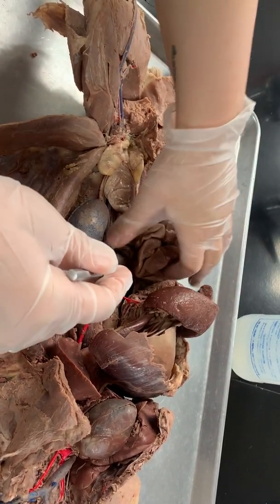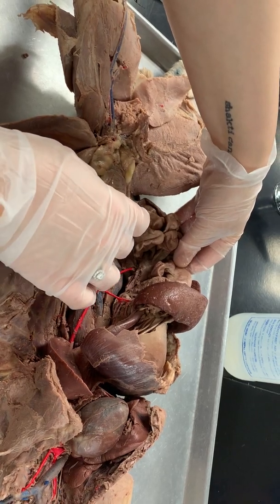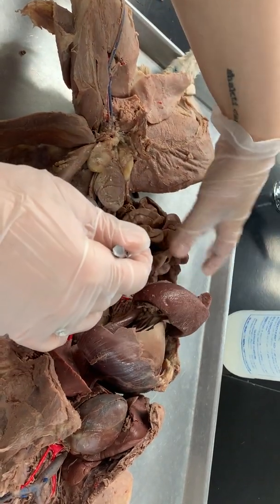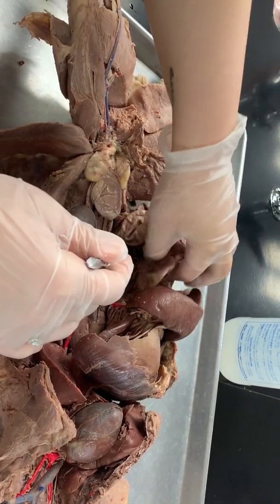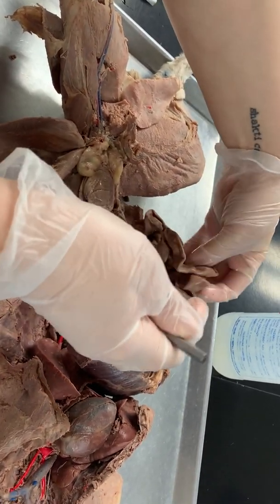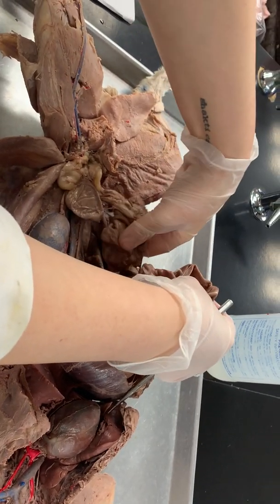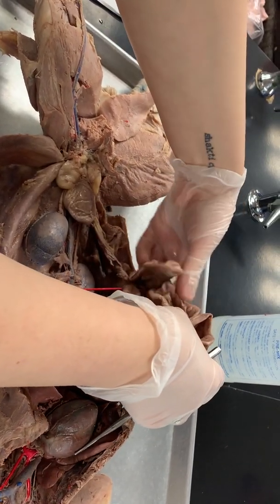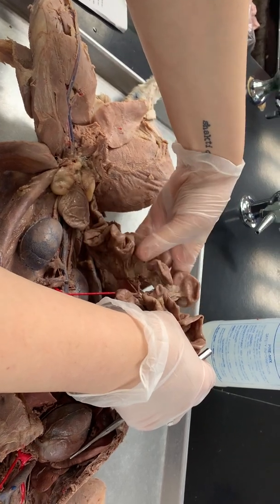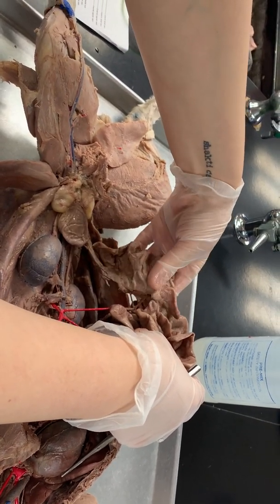All right. Here's your superior mesenteric. I like to orient to the ileocecal junction. Remember we talked about curly hair, straight hair, wavy hair, right? This is all curly hair. This is straight hair. Right, see how it's significantly less floppy. And there's a bump in the middle, and that's wavy hair.